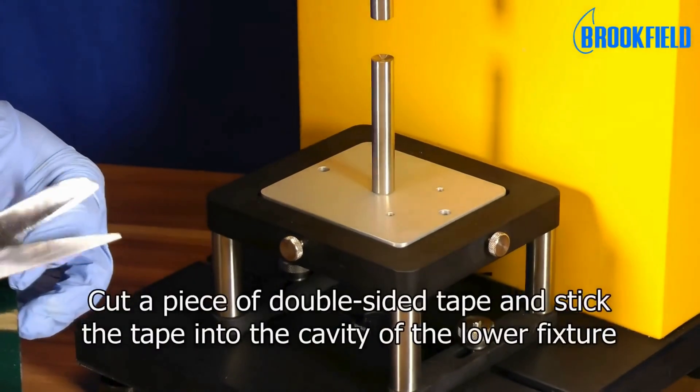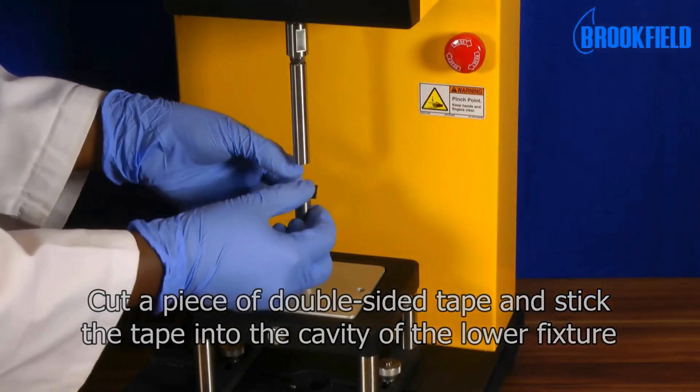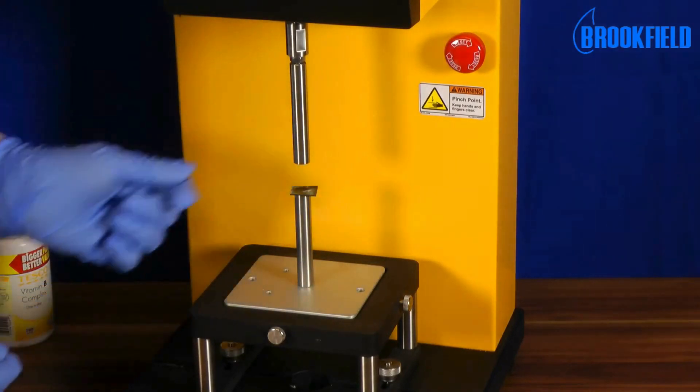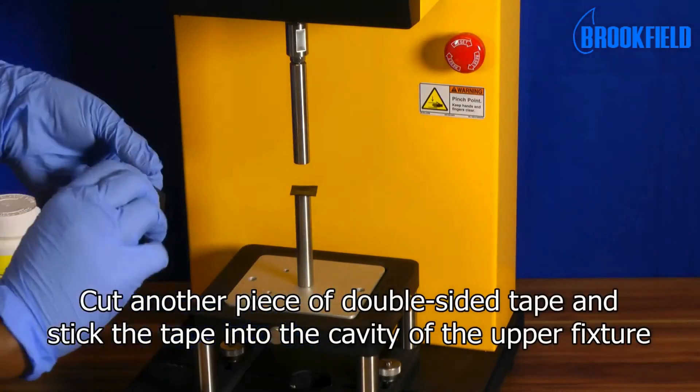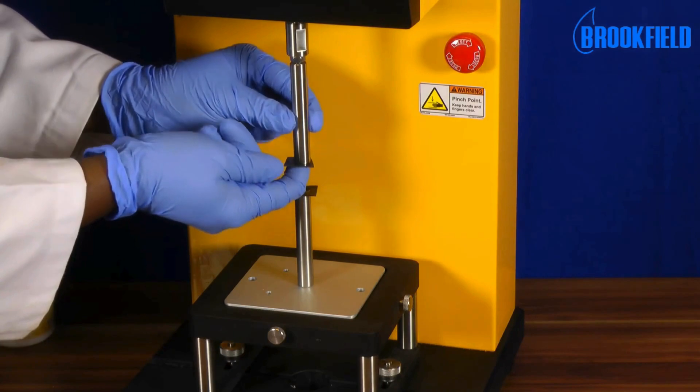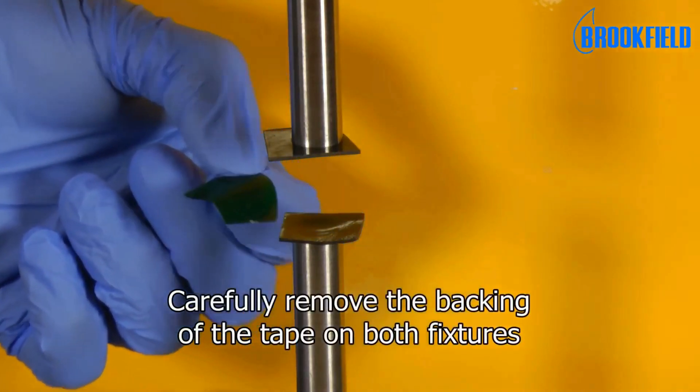Cut a piece of double sided tape and stick the tape into the cavity of the lower fixture. Cut another piece of double sided tape and stick the tape onto the cavity of the upper fixture. Carefully remove the backing of the tape on both fixtures.